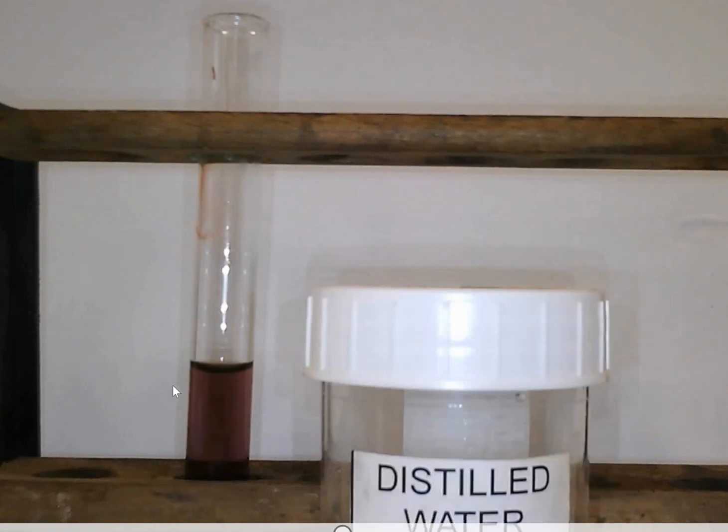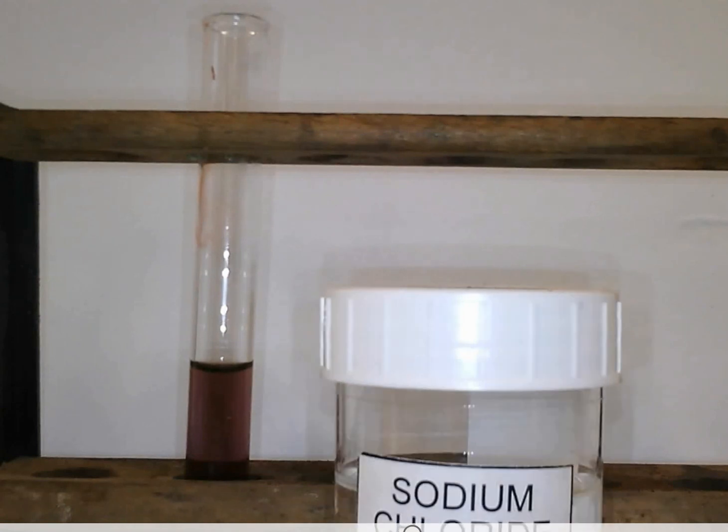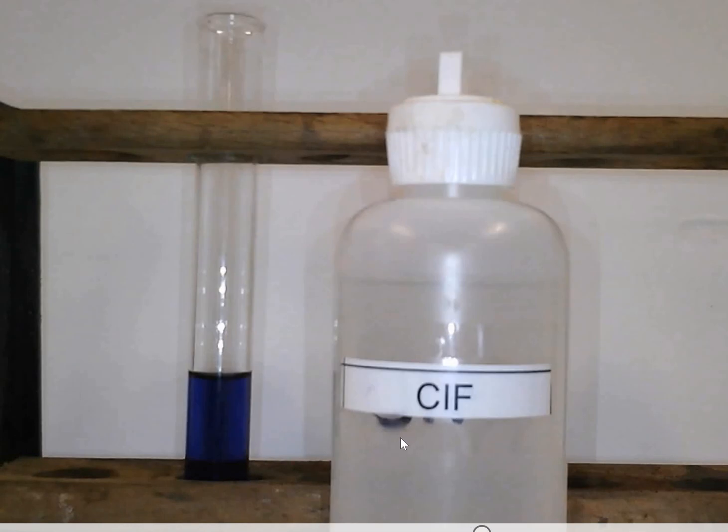Then distilled water. It's gone a sort of dirty purple, I would call that, which is what happens to the litmus when it's diluted. So that means it's not changed colour. Same for sodium chloride.